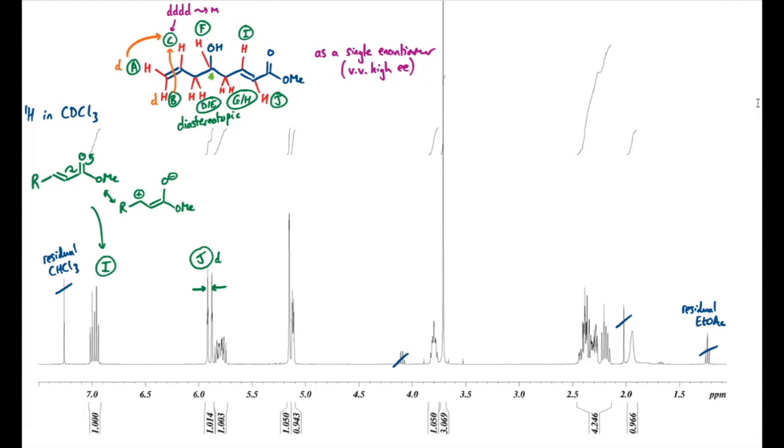Now, even just considering that allows us to see that this next peak along is probably C, this multiplet. And so we're looking for 2 more doublets, one for A, one for B. Well, in here, there are 2 overlapping doublets. What we can imagine we've got here, the left-hand side of each of the doublets seems to be overlapping. We'd expect there to be a slightly different coupling constant for these. So when we add something like this together, the leftmost peak is going to be twice the height of the other ones. And we're seeing something that looks like this.